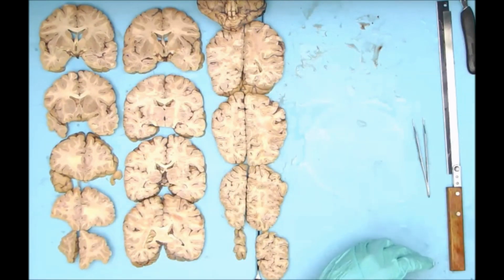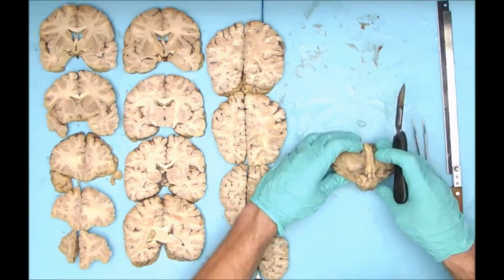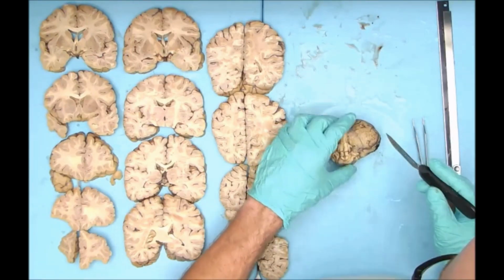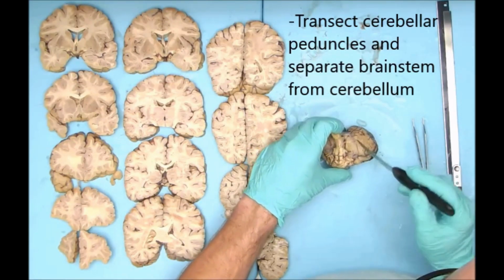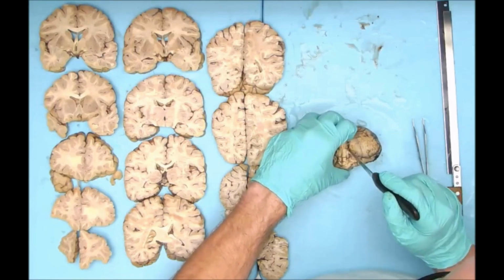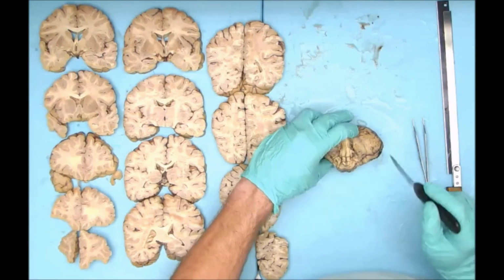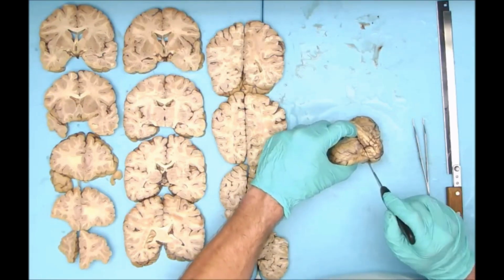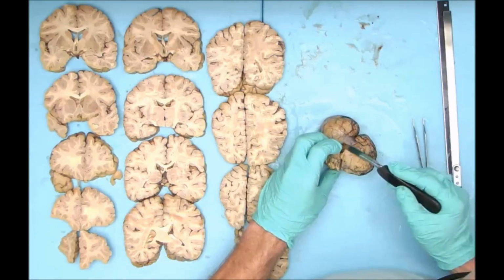So now that I've sectioned the anterior half and the posterior half of the cerebrum, I'm going to divide the brainstem and medulla from the cerebellum by cutting through the cerebellar peduncles. And you'll notice the right cerebellum, I've put a little bit of black ink over that area, because I find it's somewhat difficult to maintain the orientation with the cerebellum.